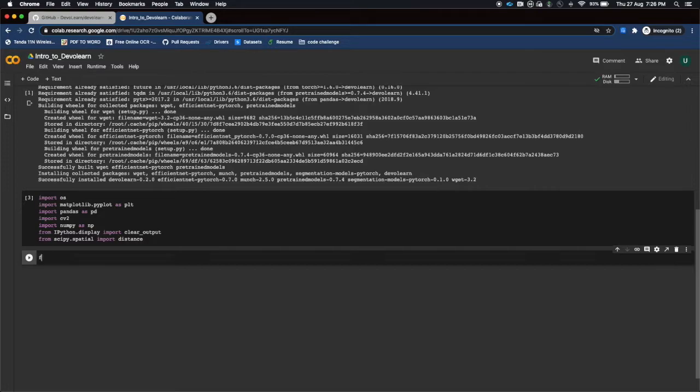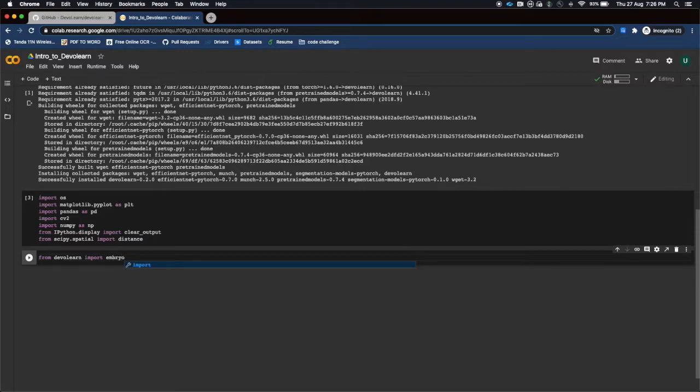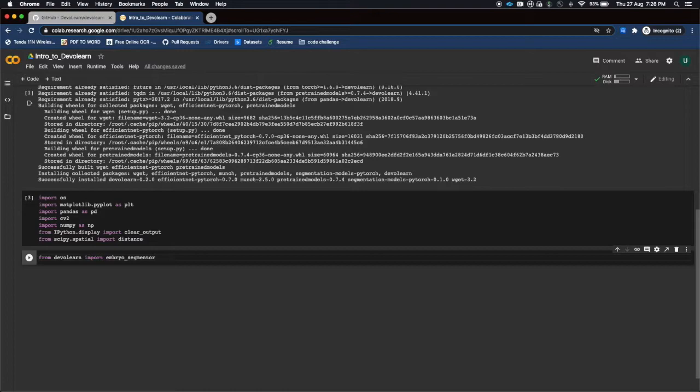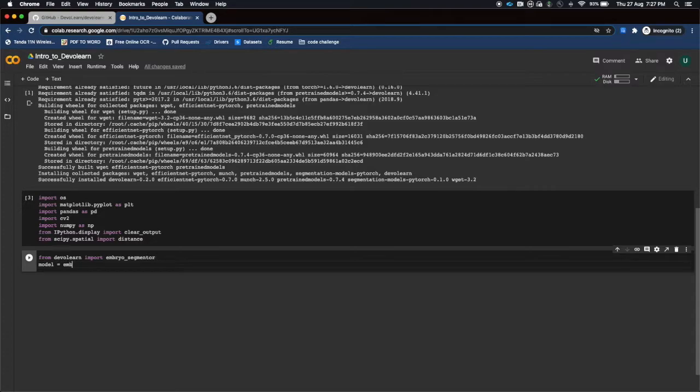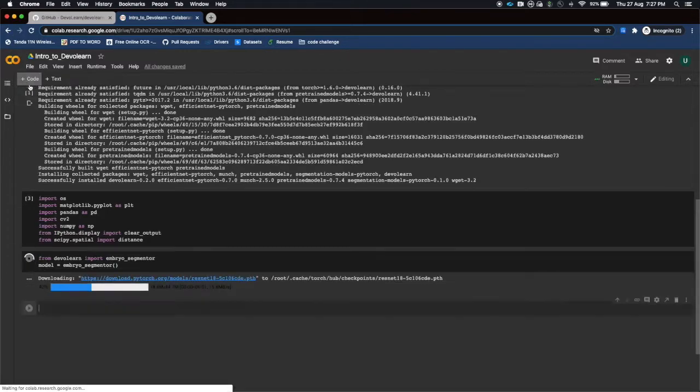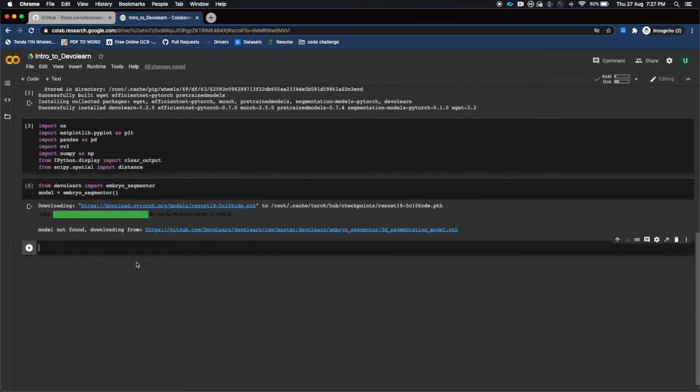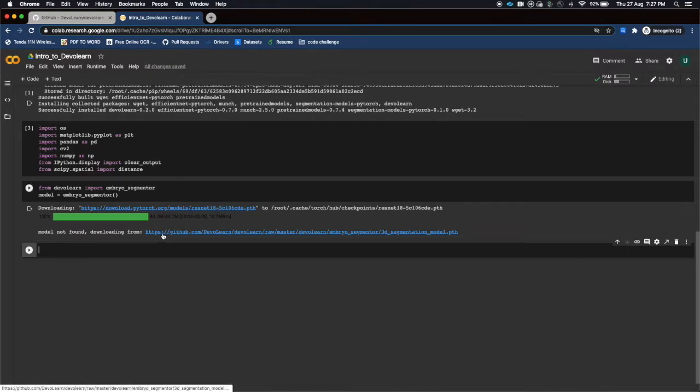After that you just need to import the embryo segmentation module. The model name in the library devolearn is basically named as embryo_segment. As you can see it has automatically completed it. After that you can store this in the model. We have successfully saved the model. It is downloading. Moving on.